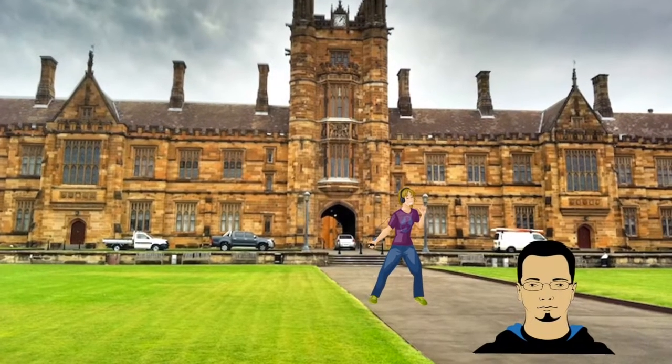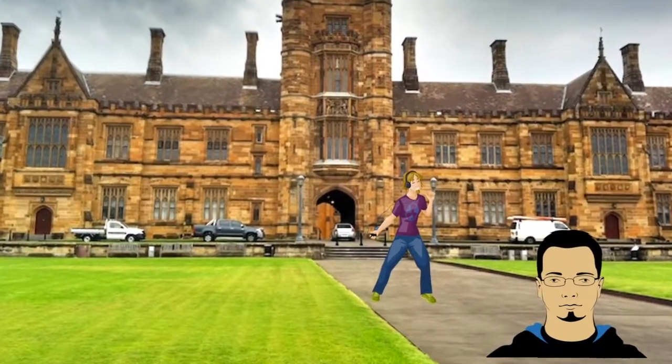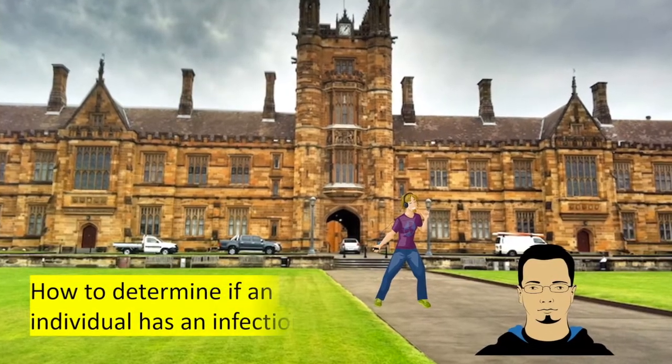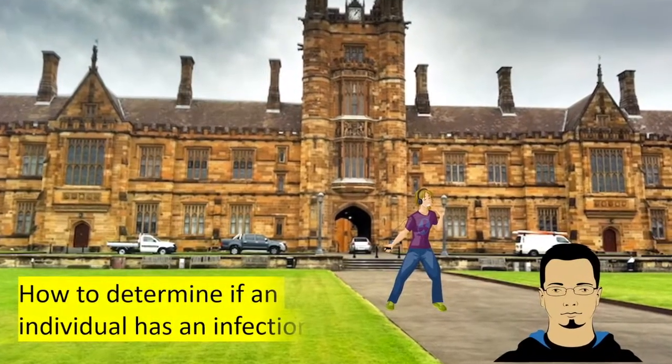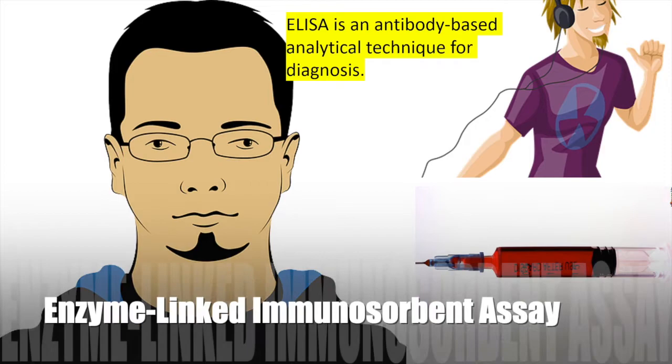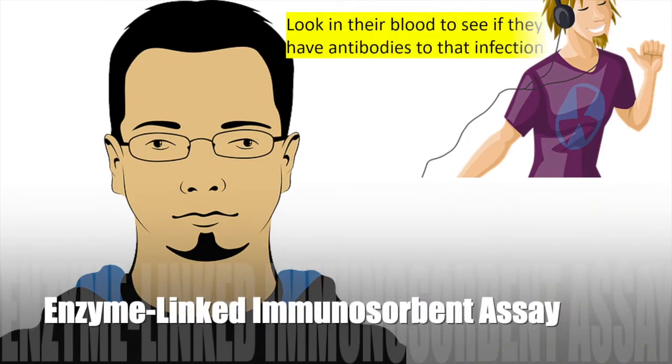How do we tell if two individuals that look very healthy have been exposed to a particular pathogen in the past? We could try and use an ELISA to detect antibodies in the blood of the individual.